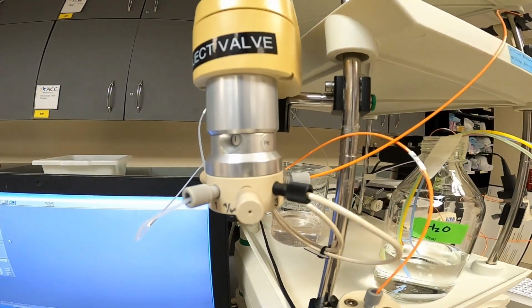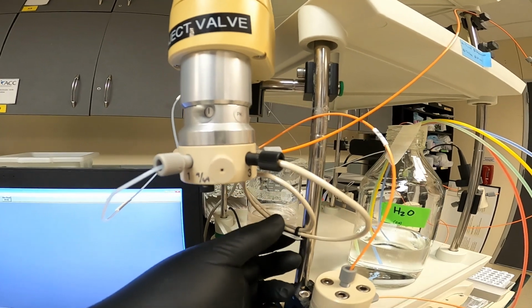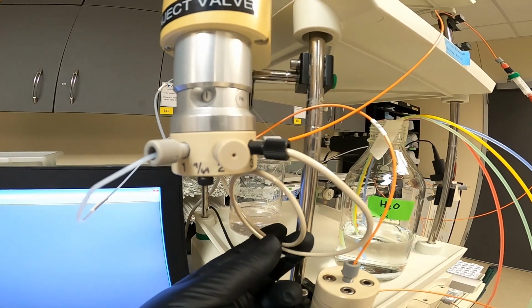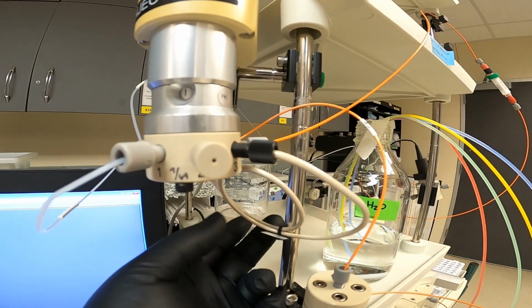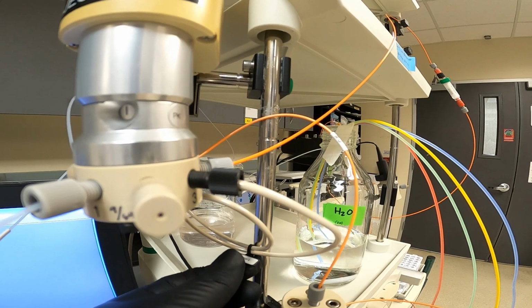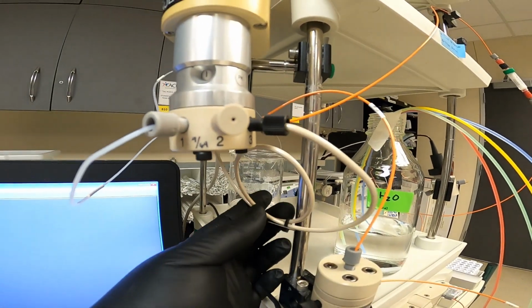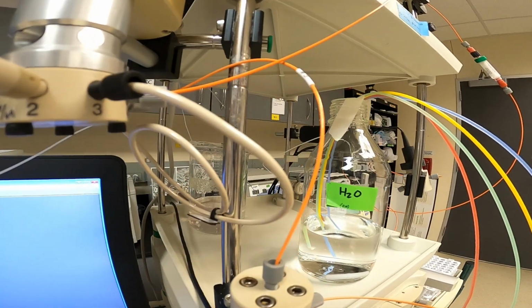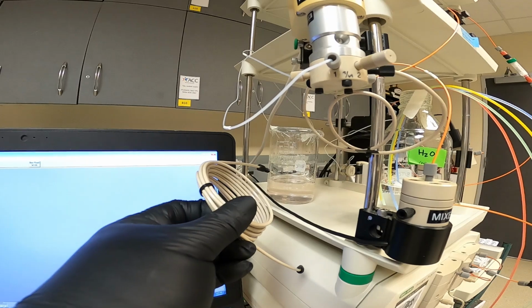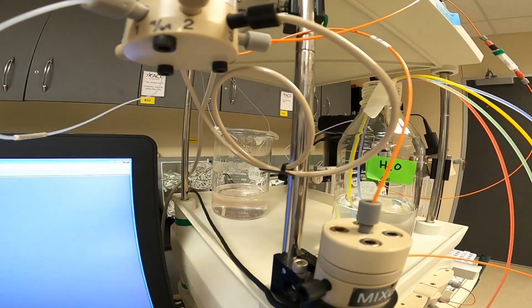So we're going to go ahead and travel down line. So here's our sample loop. This is where the protein sample sits. So if you remember, this system basically automates our purification. We're going to load our sample onto the system, and then we're going to push start, and the system will run the entire purification for us. But this is where our sample sits here. This is a 1 mL loop. Here we have a larger 5 mL loop, and these just go up in size.